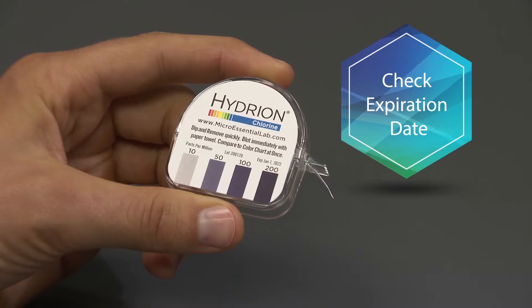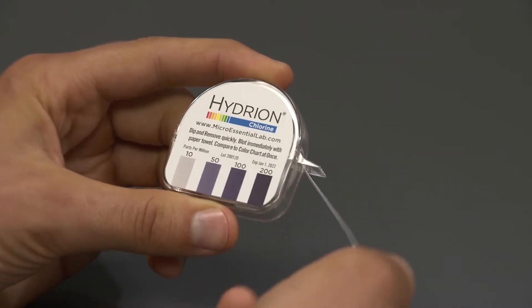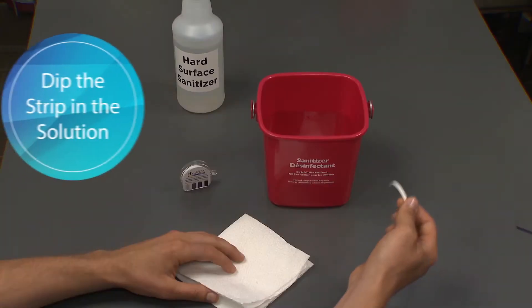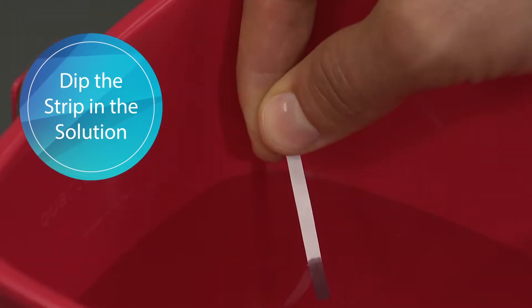Check the kit to make sure it hasn't expired. Tear off about 2 inches of test paper and dip the strip into a room temperature chlorine solution.